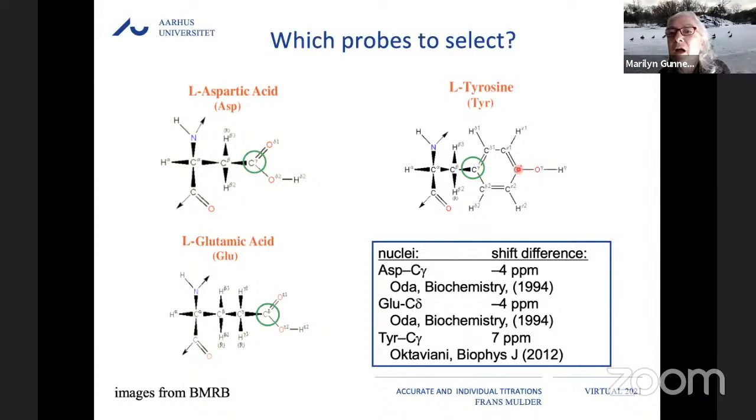So I thought at that time that the 0.4 shift of the Asps in particular, which are very short, was actually not due to anything you'd see in a tripeptide. It's relative to a carboxylic acid. And so that's just baked in from simply having two amides next to it, it doesn't matter what the conformation is. What do you think?